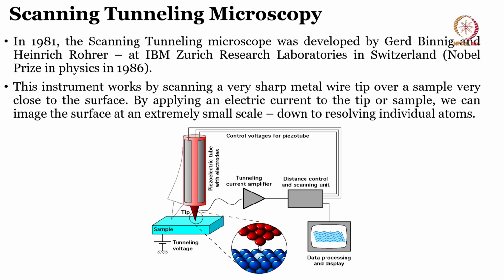This particular work resulted in a Nobel Prize in physics in 1986. The instrument works by scanning a very sharp metal wire.